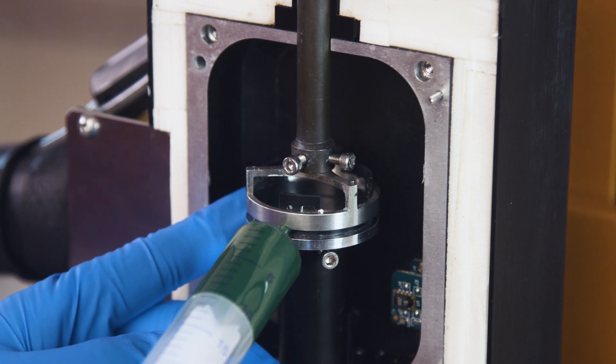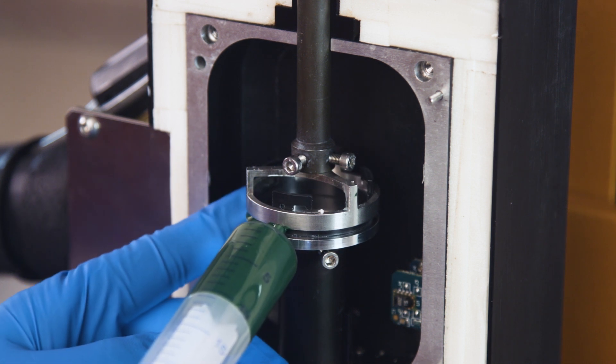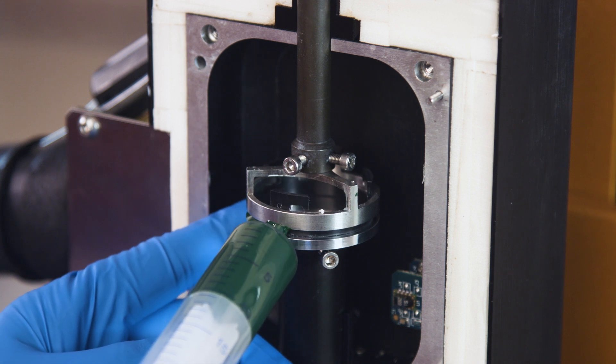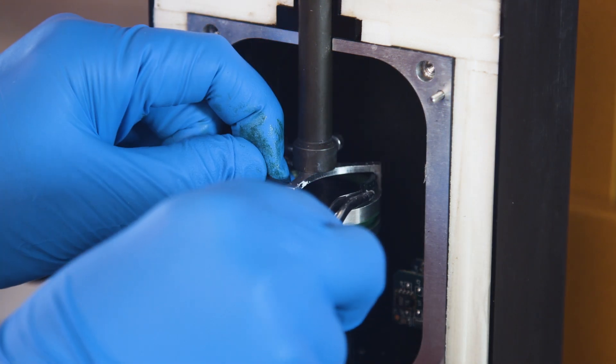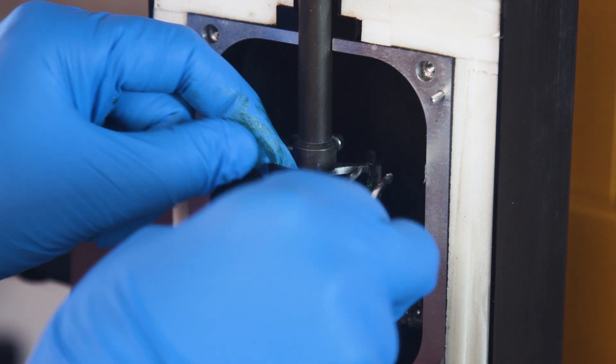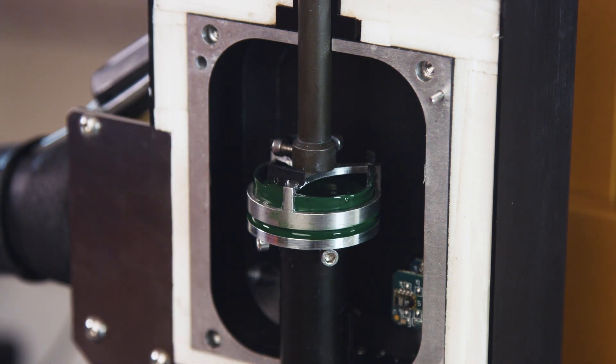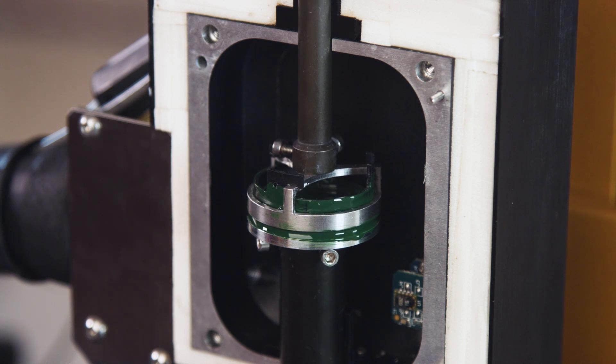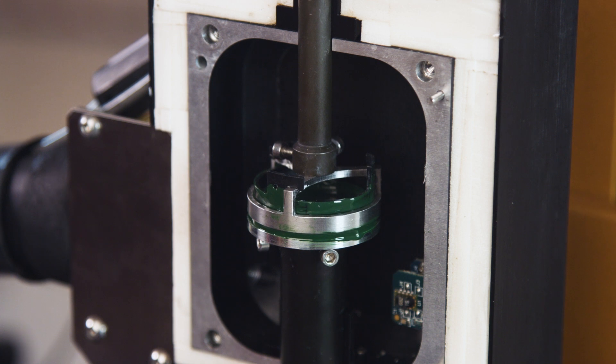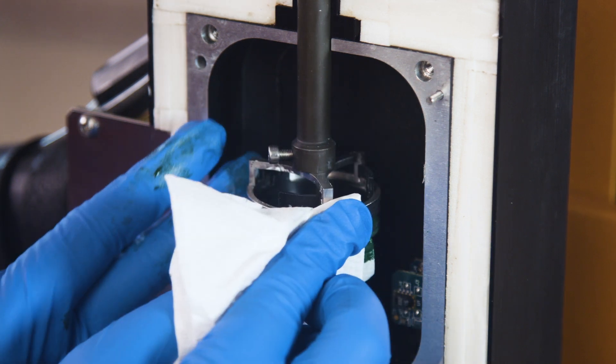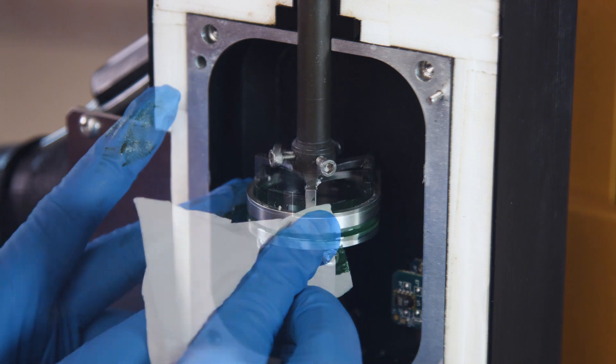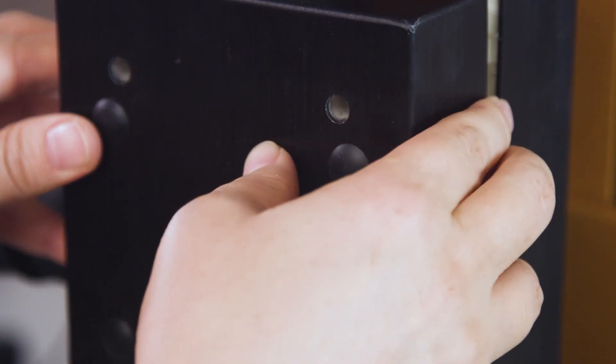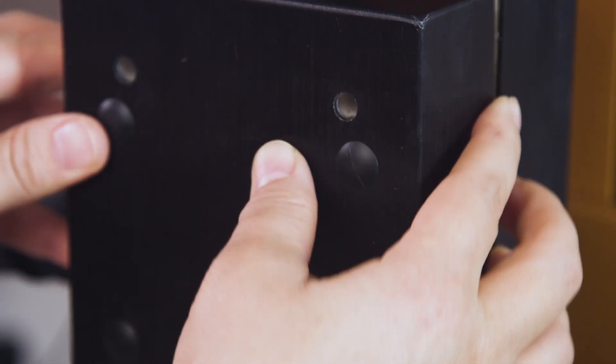If necessary, loosen the bottom plate so that it can freely rotate during sample loading. After loading, raise the inner trim ring and let it rest on the rack again. Properly lower the upper geometry until the sample is fully filled between the ring and the bottom plate. Trim the excess amount of the sample if necessary. Then, close the chamber and start the test immediately.